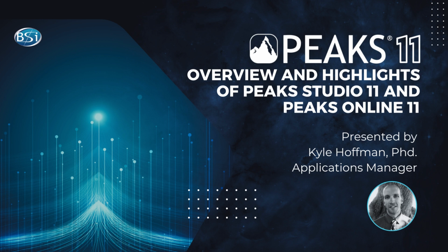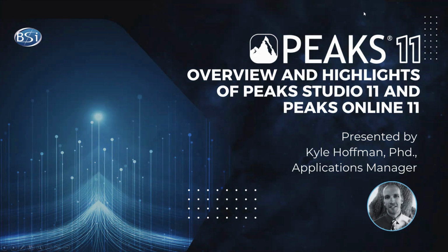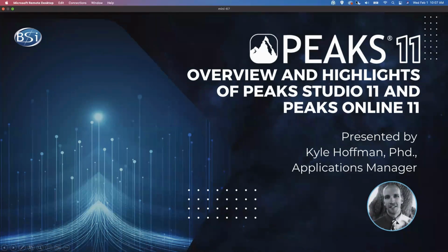Okay, I think we can get started now. So in today's webinar, I'll be going over a general overview of Peaks 11, including some highlights in both Peaks Studio and in Peaks Online.